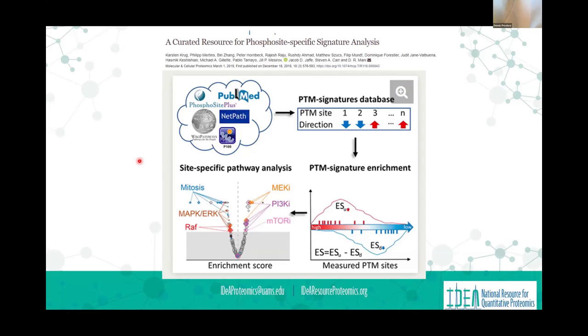And as difficult as it is to generate the data, the real difficulty in phospho is, what do you do next? How do you use this data? And it's difficult. Like there's not a good answer. If it fits within your experiment, if you see the result that you expect, it's great. You're going to see a lot more than that, right?